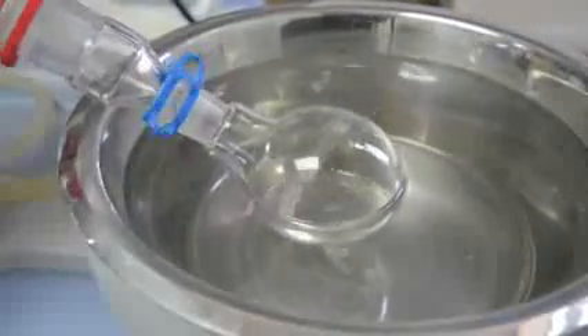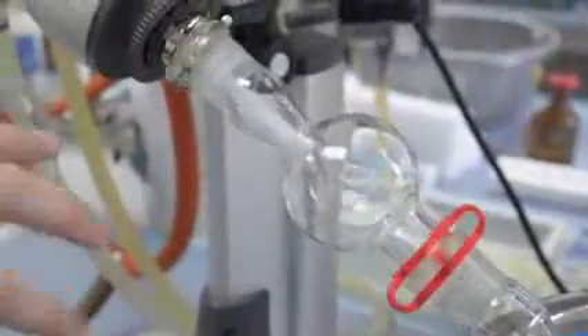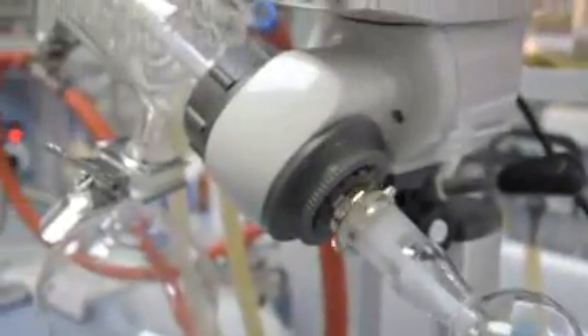The Rotary Evaporator is a common laboratory apparatus used for quick removal of solvents from reaction mixtures. This is done by heating mixtures gently under reduced pressures to accelerate the rate of evaporation.